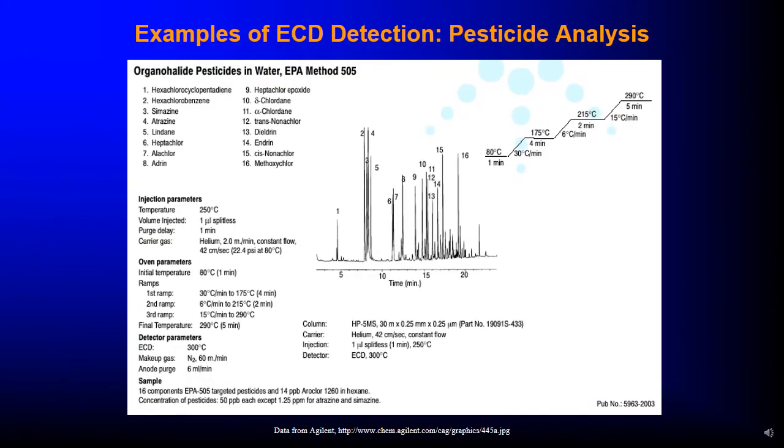Then some of the detectors you can also see here. You can also see the ramp. This one now shows further detection, organohalide pesticides in water.